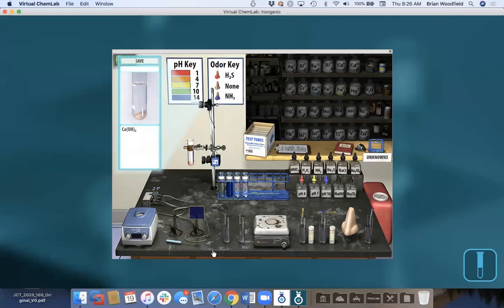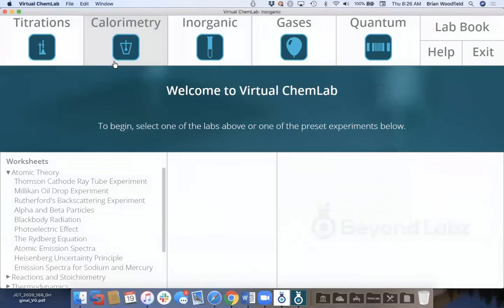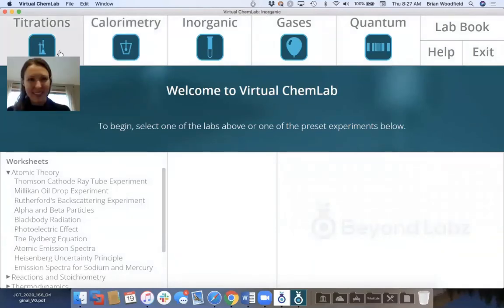And so this is classic. This is just a classic inorganic lab, and you can do any level you want with it. So any questions before I go on? Feel free to just unmute your line if you want to directly ask a question.